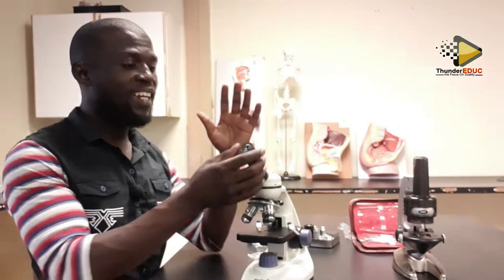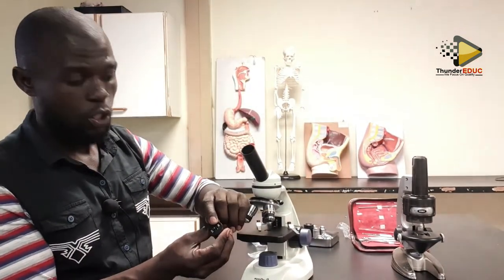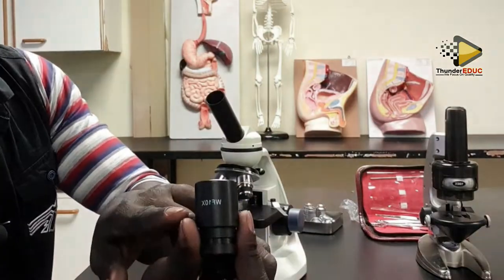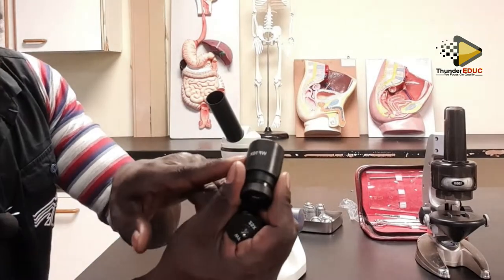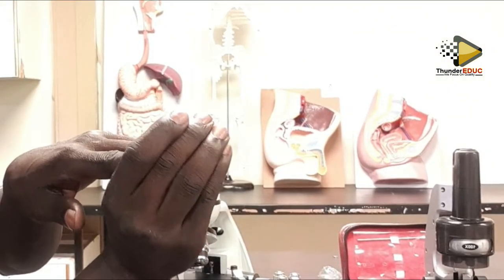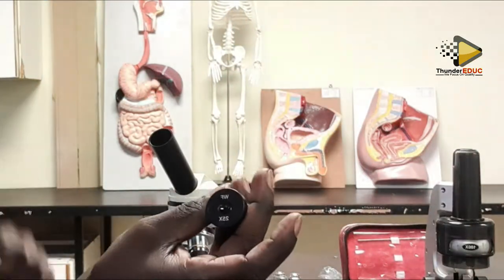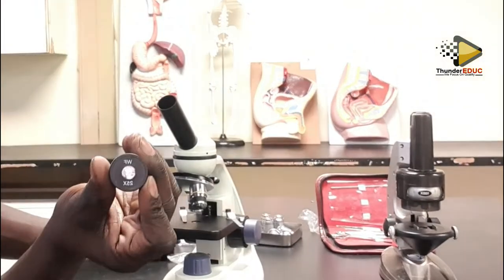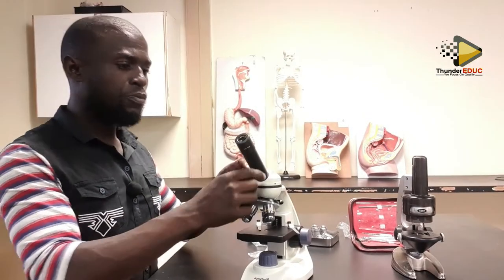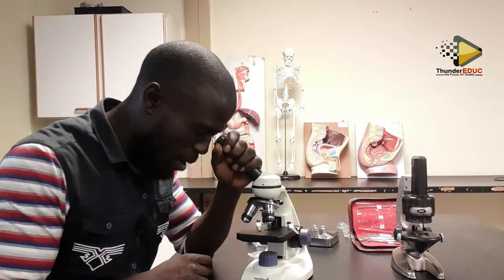Eyepiece comes in different versions. When I talk about the version, I'm talking about the magnification. It can come with this magnification, or it can come with a different magnification. This one, if you look at it, is 10 times. It means it's going to magnify the object 10 times, while this one is going to magnify the object 25 times. So you put it there and then you are able to view.